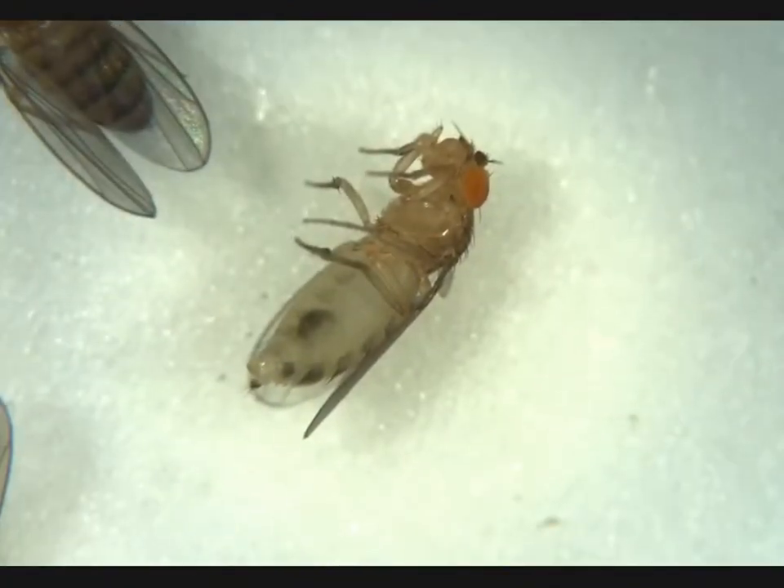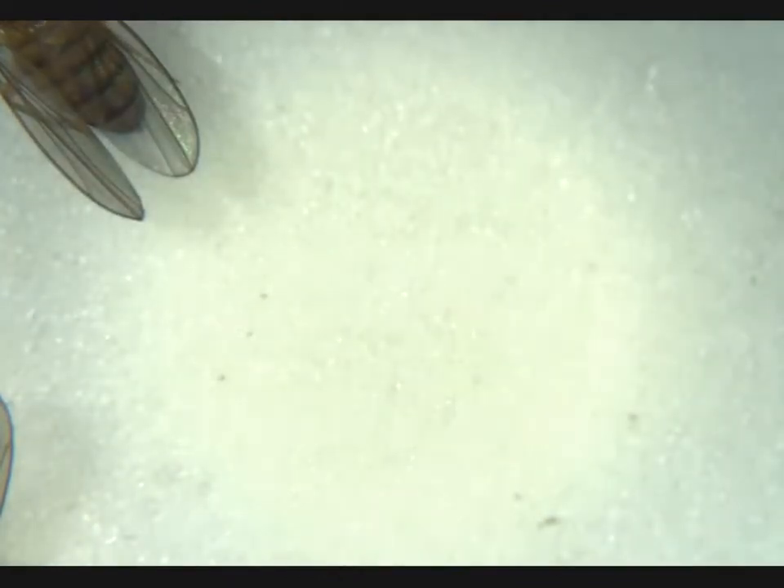Next up, we see we have a virgin female. We see an obvious meconium. No penis apparatus — just what we're looking for.